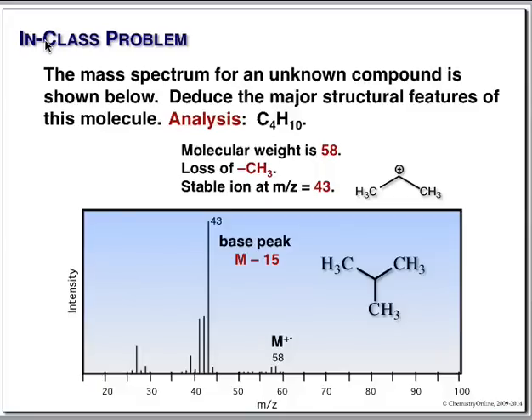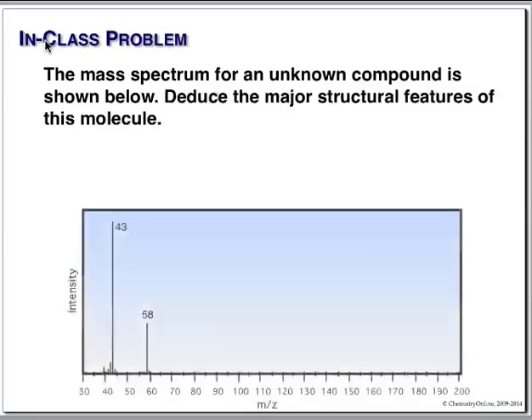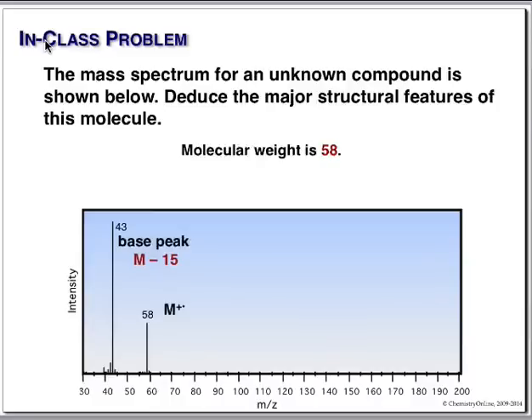All right, well, that was simple. Look at this one. Oh my gosh, it's deja vu all over again. Peak at 58, peak at 43. This is our molecular ion. This is M minus 15, and it's our base peak. Just like last time, our molecular weight is 58. We lost a methyl, and we formed a 43.